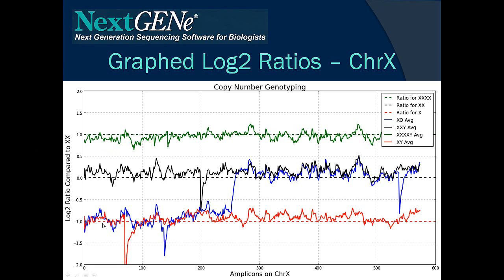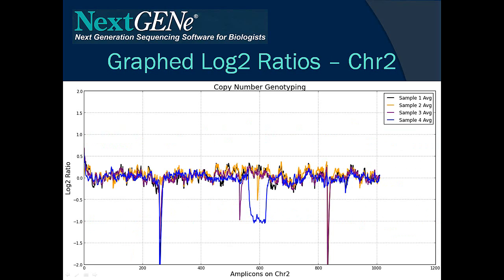This XO genotype appears to have a deletion in the first portion of the X chromosome and normal XX coverage in the second part. You can also see that there are about 10 times the number of amplicons on the X chromosome as there were on chromosome 21. As a sort of control, here is a normal chromosome where we don't expect to see any very large chromosomal abnormalities. The majority of amplicons on this chromosome are at a ratio of around 0; however, in sample 4, it looks like there could be a deletion, since we get a ratio very close to negative 1.